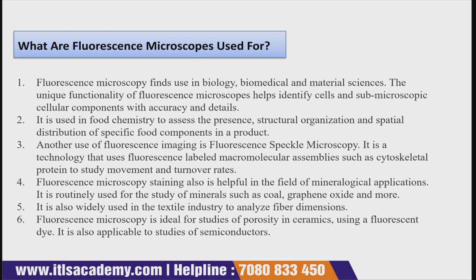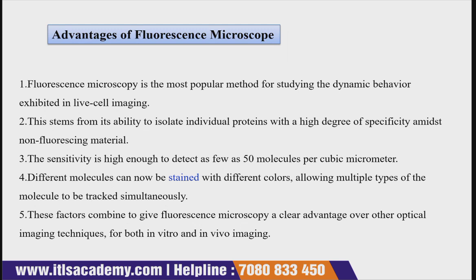Apart from this, it has great importance in the food industry, where it helps in food chemistry and is used to assess the presence, structural organization, and distribution of specific food components in the product. So these are the uses of the fluorescence microscope.